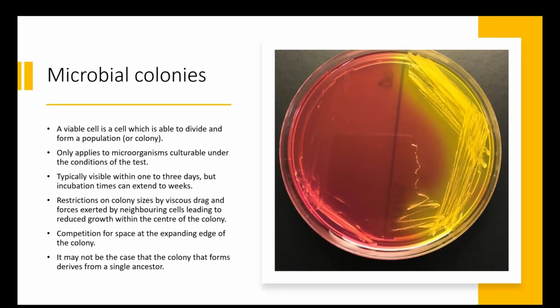With microbial colonies, I'm sure most people online will be aware, a colony is a representation of a viable cell, a cell that is able to grow on a growth medium, typically a standard agar plate, and to form a population.